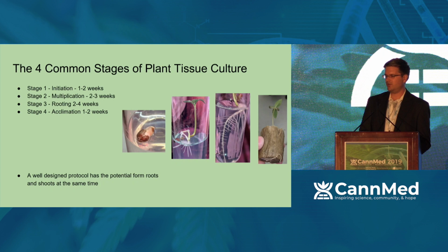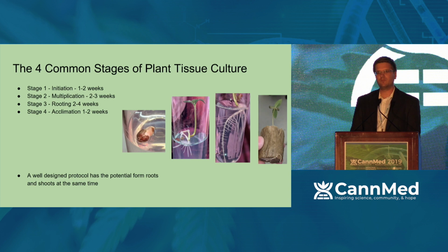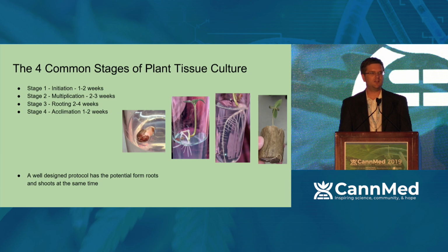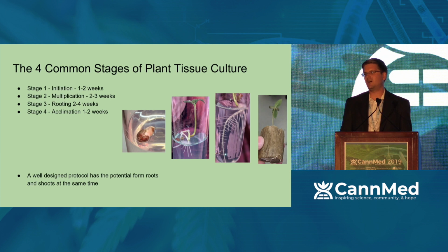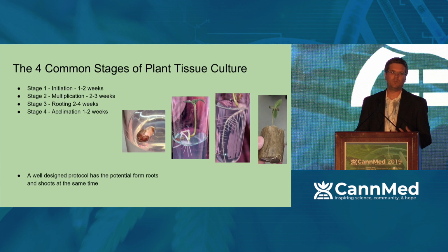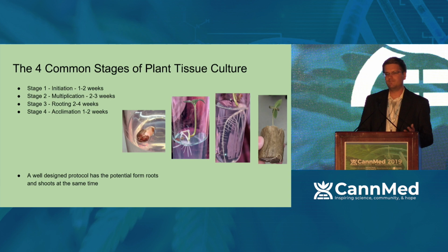That rooting stage I need to talk about really quickly, and I'll get into this as well. It's very hard to establish a set rooting protocol for every single cultivar of cannabis. I've read some literature talking about hops and people trying to do indirect cell organogenesis, where it only works some of the time on some cultivars, but not all. And so you run into a lot of problems going down that path. I have found that if you germinate seeds, or quote unquote, a well-designed protocol, so straight MS media, it takes about 8 days to root and shoot at the same time. That can exponentially cut down on your propagation time, but if you do it for cuttings, you have to develop that individual protocol for that individual species of plant, and that is something most people just don't have.